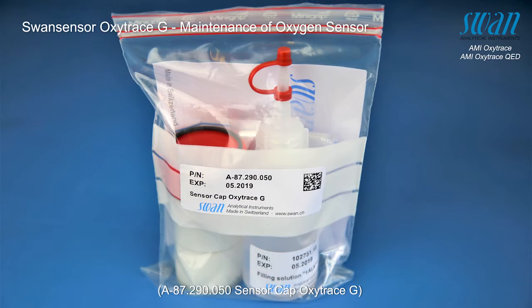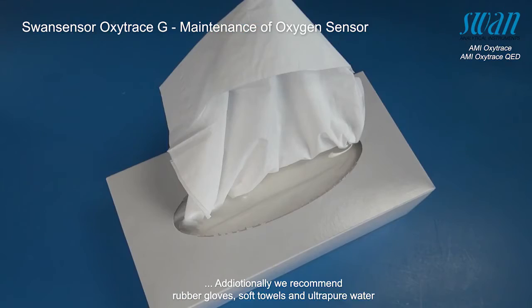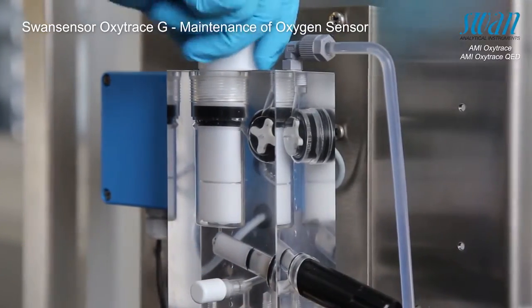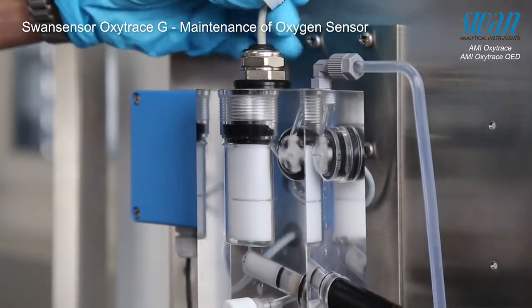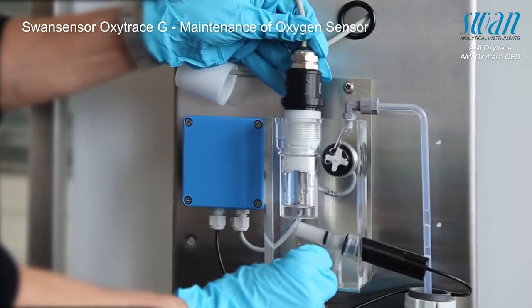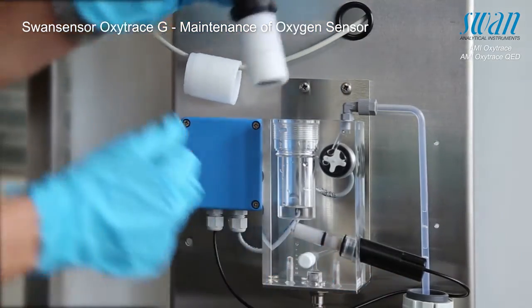The following procedures need to be performed before getting started. Stop sample flow by closing the flow regulating valve. Unscrew the fixing sleeve. Finally, remove the sensor from the flow cell. Please pay attention — do not pull the sensor out with force. To avoid damaging the sensor, slightly open the flow regulating valve before attempting to remove the sensor from the flow cell.